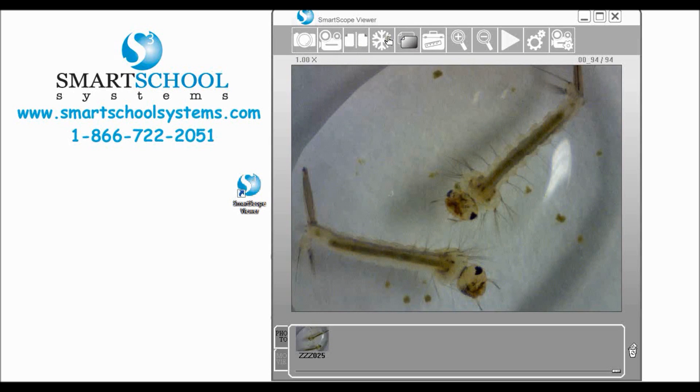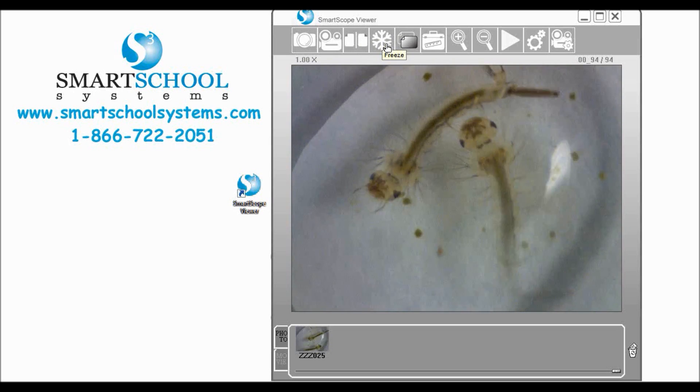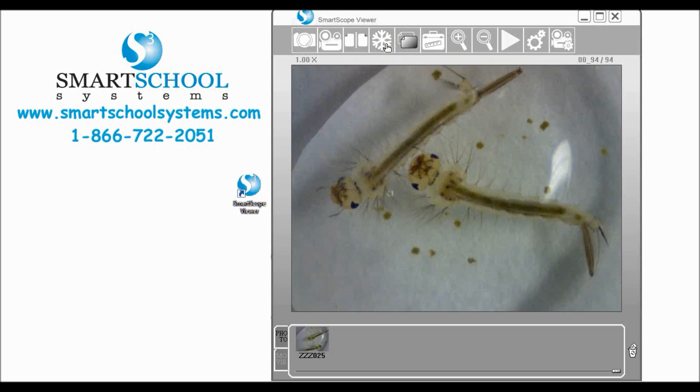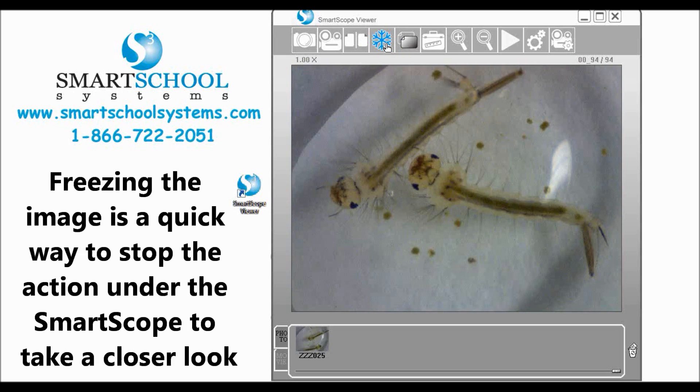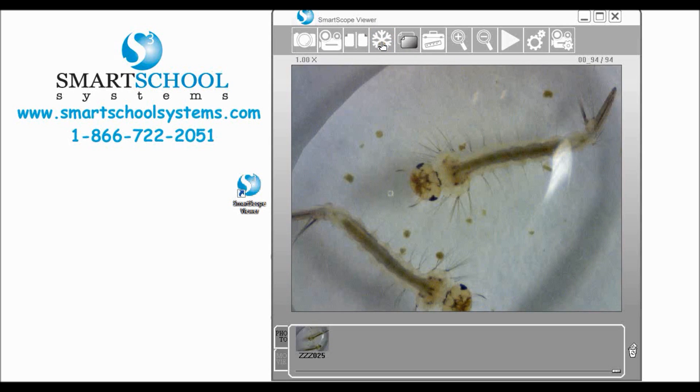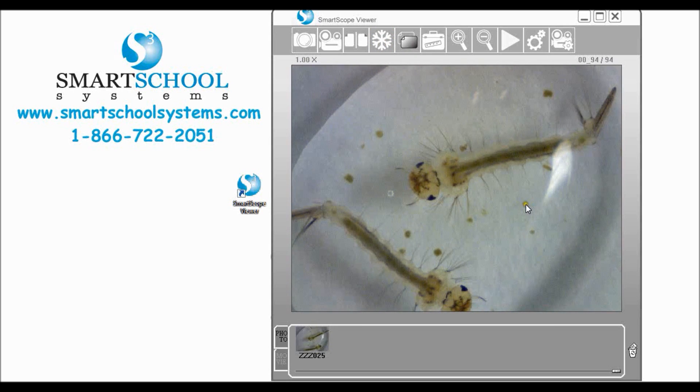Now if we go over to the snowflake icon we can freeze our image by simply clicking that and that is great for just having that moment, that instant where I just want to see this or I want to show my students this one thing as they're coming in and it just makes it really easy. When you want to come out of it simply click freeze again and you're back to your live image.